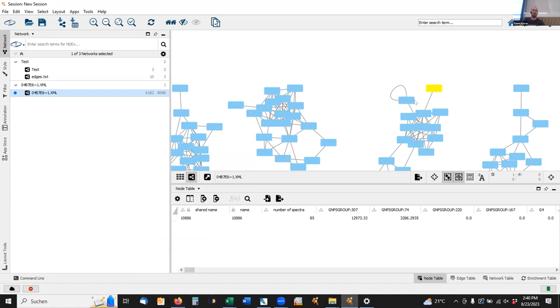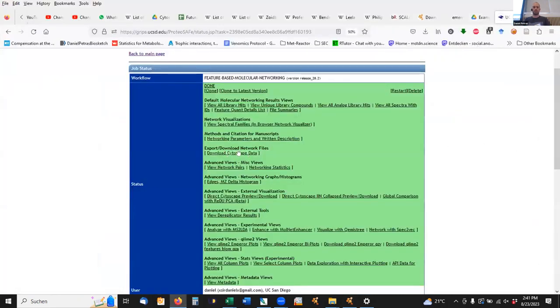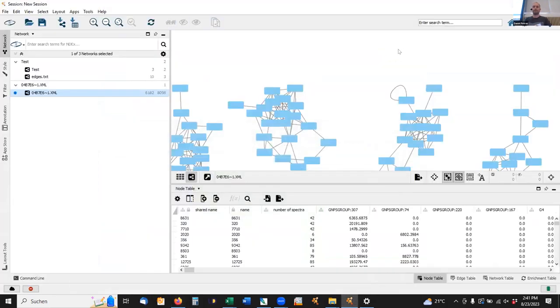Here you can show the pie chart too, you may just need to indicate it through the mapping. For now, I would suggest you use the Cytoscape download, this one here, as the other one sometimes is buggy. But yes. All right.